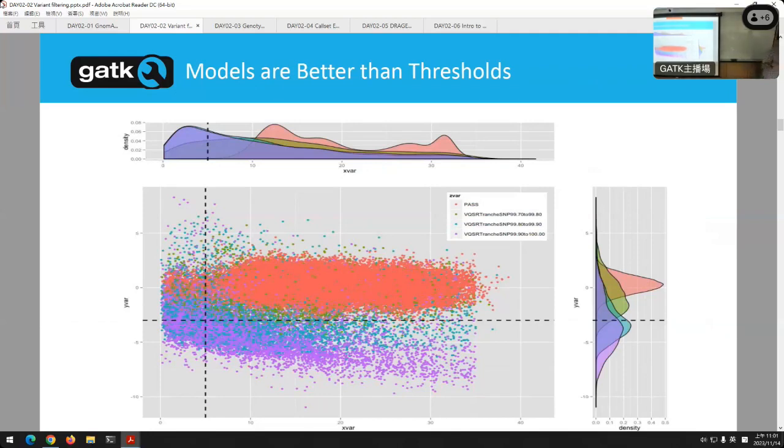And so all the statistical models that you're going to learn about all produce a score and allow you to choose the cutoffs. And there are always recommendations, but ultimately it's up to you to choose what you want for your own projects. Okay? On the rare variant side, where they don't want to miss the one mutation that could be causing disease, their cutoffs are very low. Okay? In population genetics, they don't mind missing some SNPs here or there.